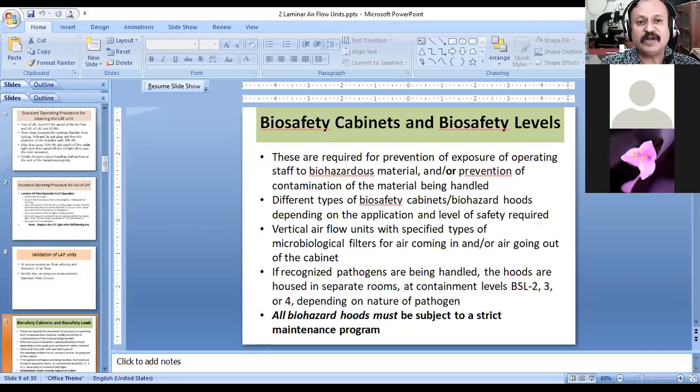Now let me tell you about the different essential features of biosafety level 1. So the conditions in which a person is working, if it is biosafety level 1, then it will mean that certain necessary things should be there in that particular facility. One important thing is that the access is limited. That is, many people or different people are not allowed to enter that particular facility. Of course, there is a restriction on who will enter that facility and who will work over there. That is defined, and no other outside person especially is going to enter that particular work area.